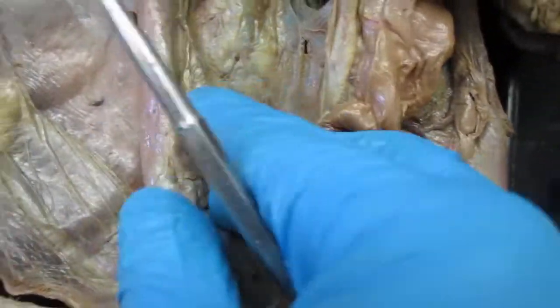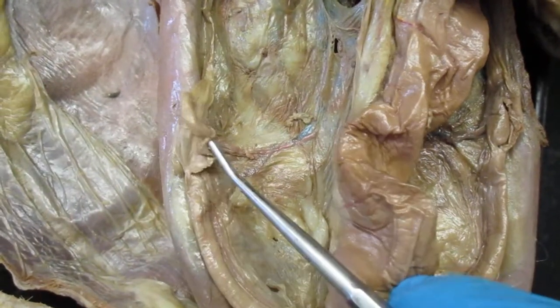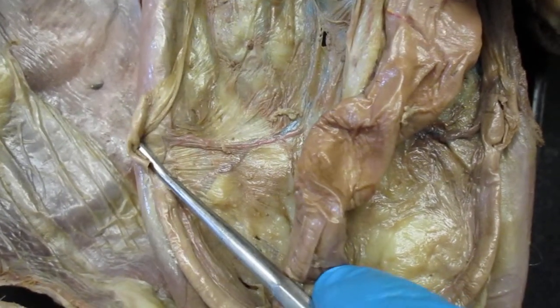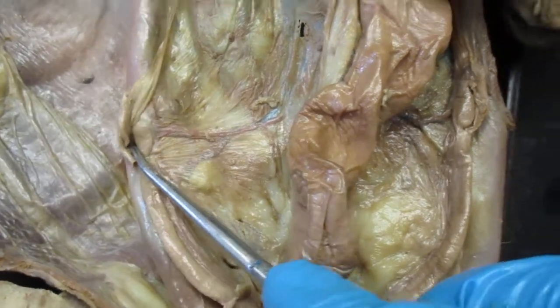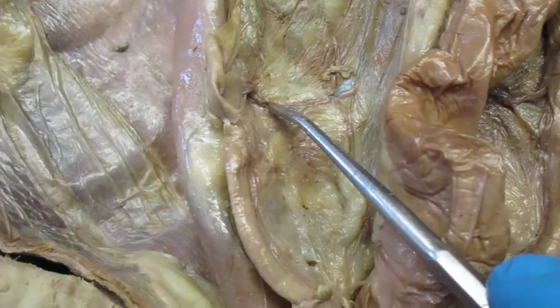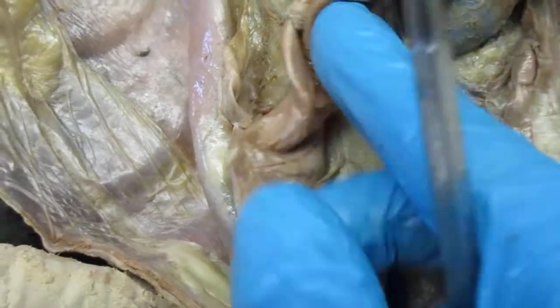Now, I don't know if you can see this or not, but you can see blood vessels, just barely. If you look at this ovary here, so here's the right ovary. You can see blood vessels, the ovarian artery and vein that's going toward this ovary.